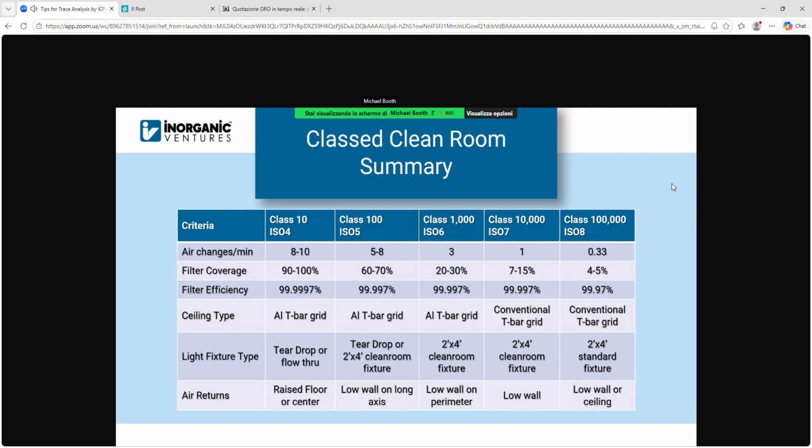So one of the big things that we did this on was we changed out our ceiling tile type. Our ceiling tiles in the lab years ago were that kind of plastery material that was kind of brittle. So if you touched it or rubbed it, it would break apart into little pieces. We changed that out to a more plastic, solid ceiling panel. And we took measurements before and after we did this. What we found afterwards was that particle count dropped considerably. So that was evidence that yes, this is a good change to make. We're seeing less contamination. And in general, we saw less dust in the lab after changing out also. So just something to keep in mind.